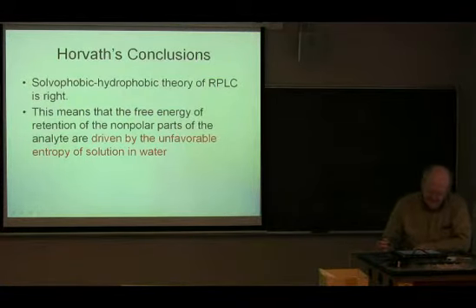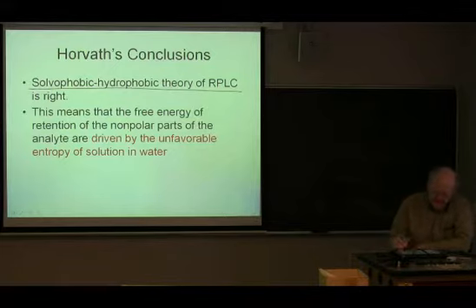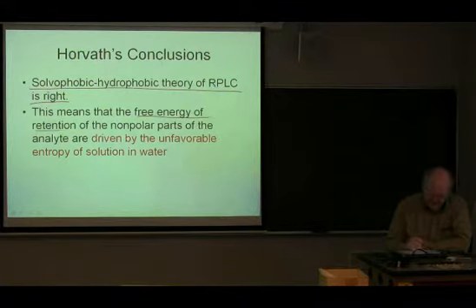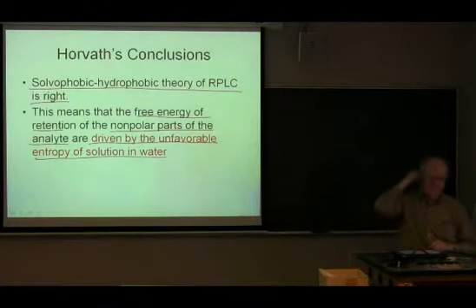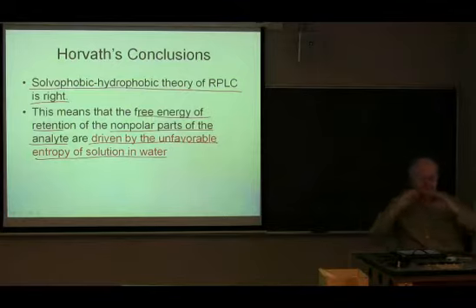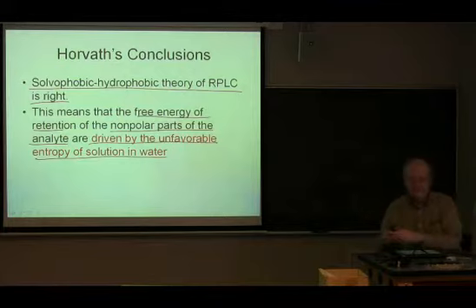So Horvath's basic conclusions are that the solvent-phobic hydrophobic theory of reverse phase chromatography is right. This means that the free energy of retention of the nonpolar parts of the analyte are driven by the unfavorable entropy of solution in water. And he's saying hydrophobic effect, dead on, no problem. Forget about lipophilicity, doesn't matter. He's agreeing with Tanford, he's agreeing with Breslau, he's agreeing with the received wisdom at that point in time.